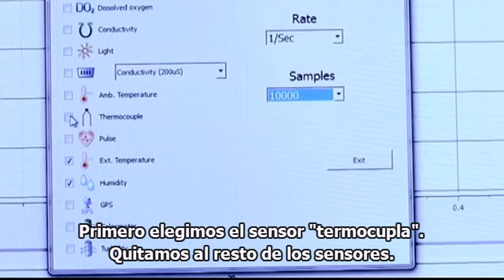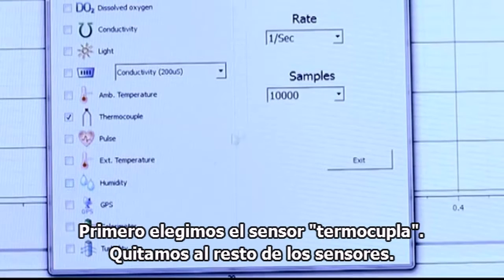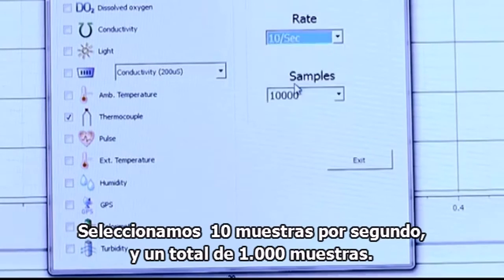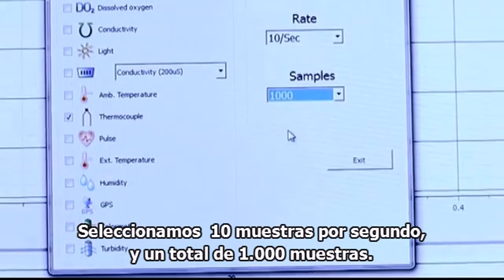First, let's select the thermocouple sensor, uncheck all other sensors, take 10 samples per second and 1000 samples.